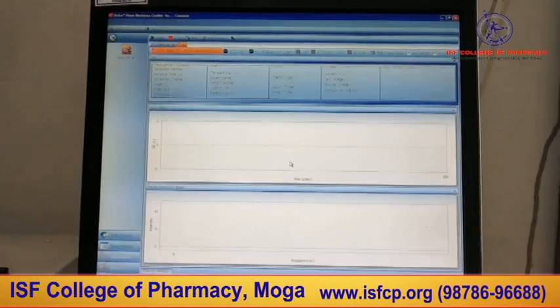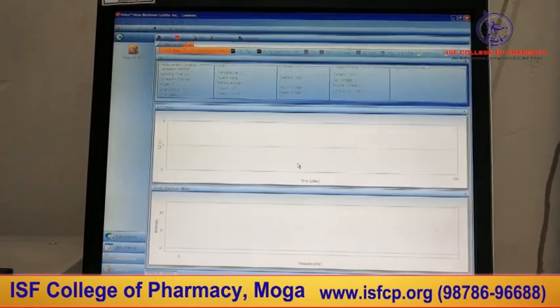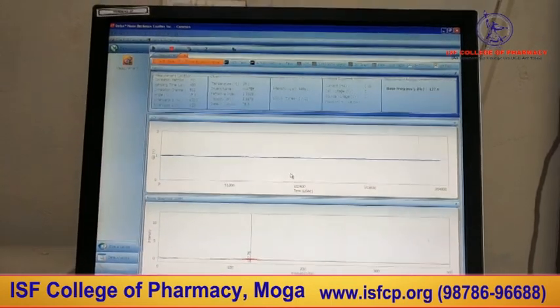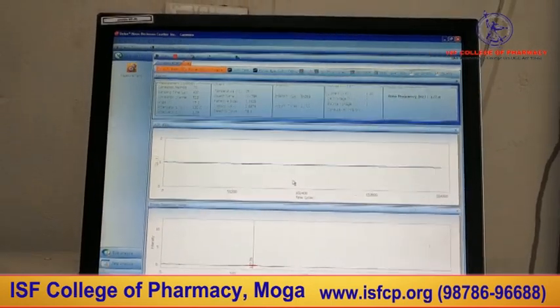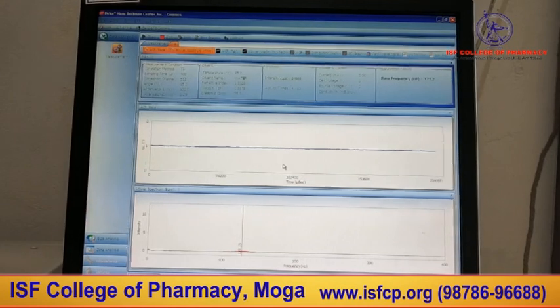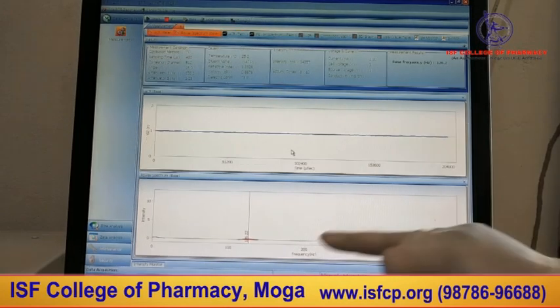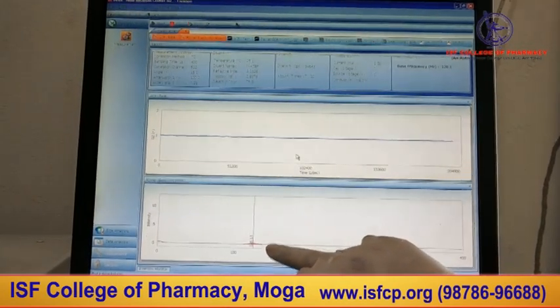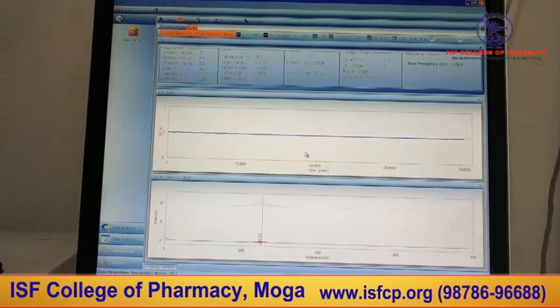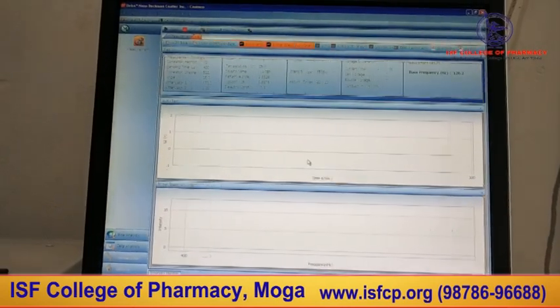Now you can hear a certain sound from the software end. It indicates that the instrument has started, maintaining its acquisition mode. Now the process has just begun. Look at the fluctuation over here. Once again, the instrument will take cumulatively many results for Zeta potential measurement.